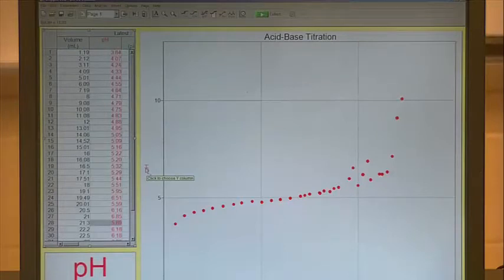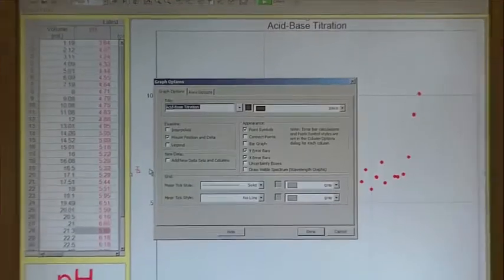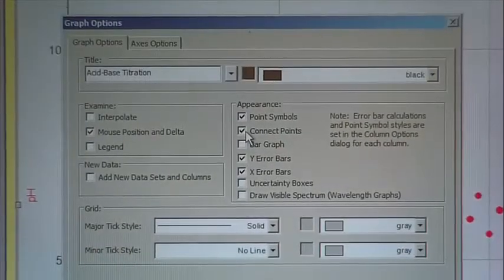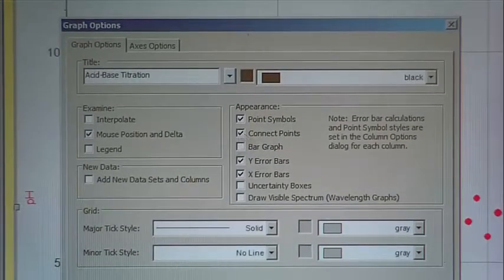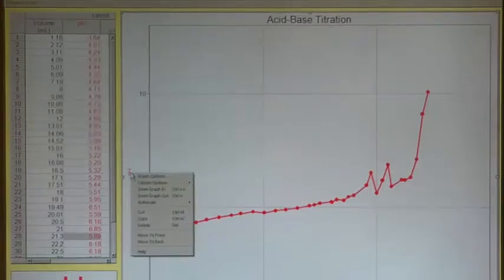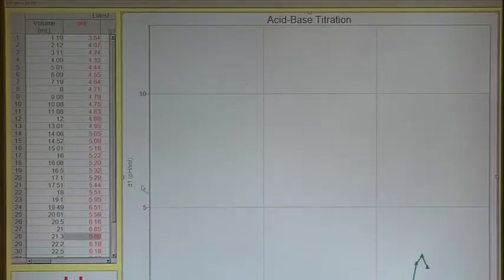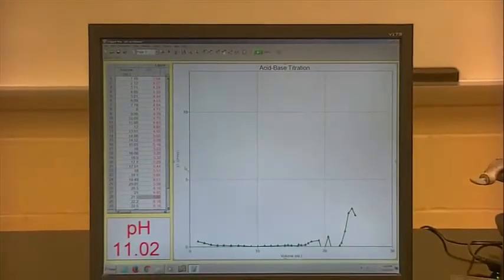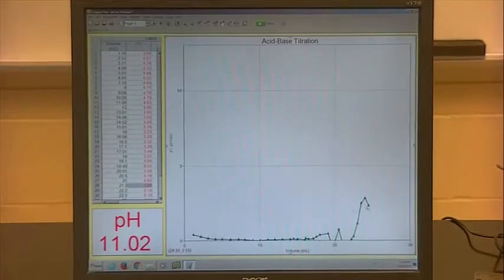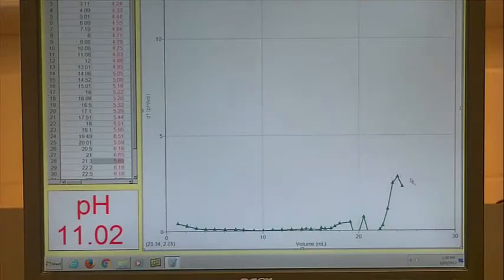So we're going to go here to the y-axis and we're going to right-click. And we're going to click on graph options. And under graph options, we will check the box that states connect points and click done. So we've connected the points here. And now we'll go here, right click. We will click on the y-axis label pH. We will click on D1. And that will be your D1 curve, your equivalence point should be a peak here. So your equivalence point is probably going to be here, 20 mils. This is where I kind of messed up on the graph.